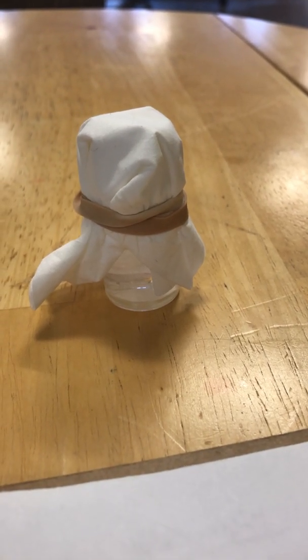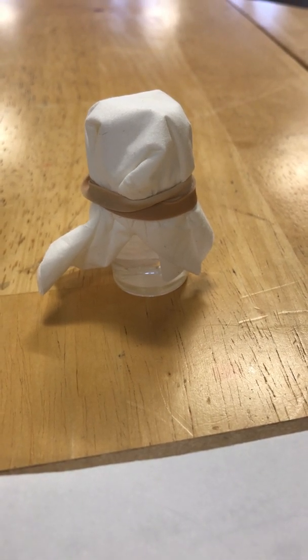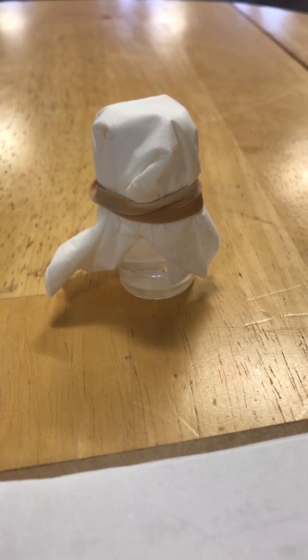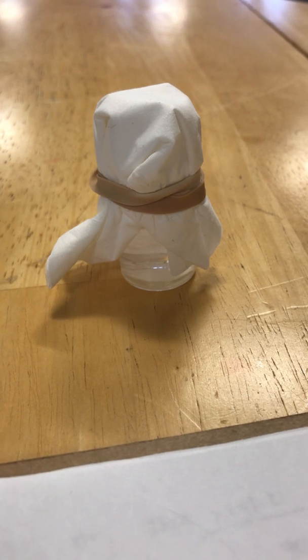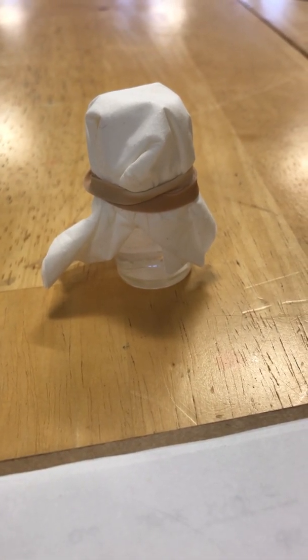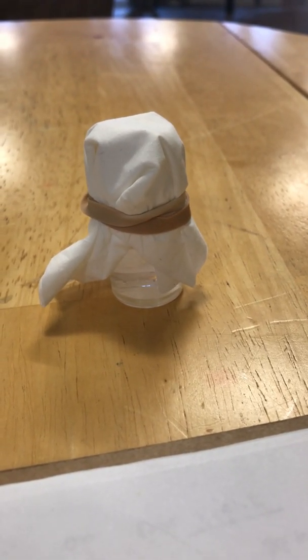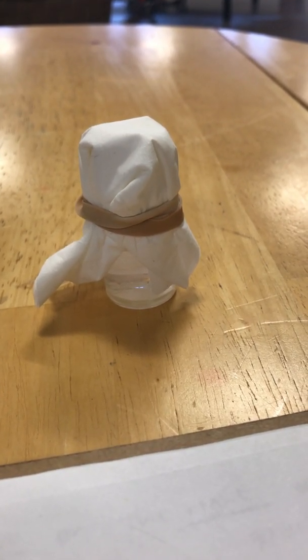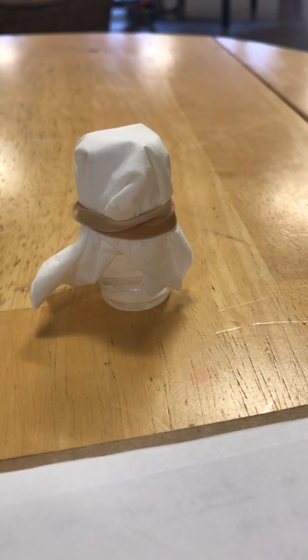My experimental yield was not exactly 100% because the reaction may not have produced the exact stoichiometric amount of product. We also could possibly have less due to inaccuracies in scraping the product out of the original container or something like that as well. And then the fact that the crystals are not perfectly clear suggests that there are impurities in the solution, which could be a result of impure alum. And then this impure alum could be a contributing factor to our very high experimental yield.